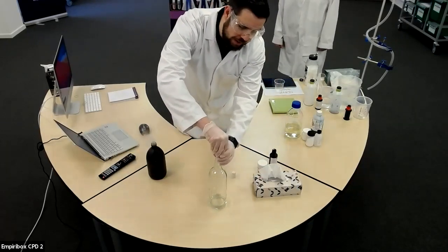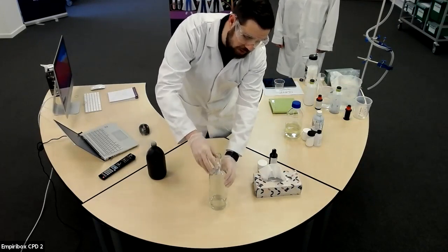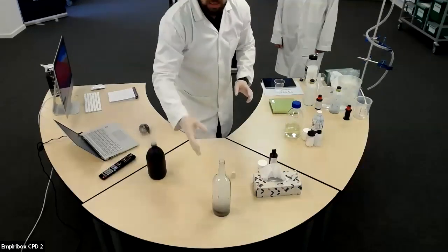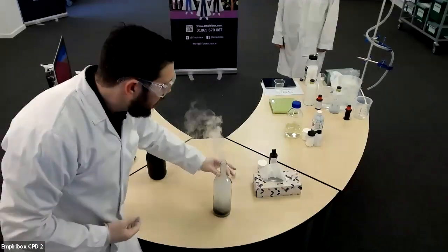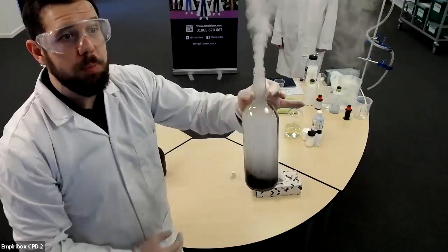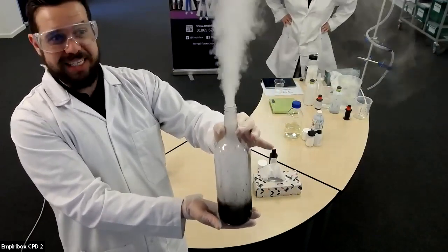Boys and girls, I'm just going to quickly pop that in there, and you're going to see what happens when I make them react with each other. If I just shake that in, you can clearly see, and there we go. This is a much clearer one. It just starts to produce a lot of smoke, and it goes almost everywhere. But there are a few other things that you might have noticed. Not just the smoke billowing out all the way, as you can see quite nicely, like a genie in a bottle. That's a much nicer one, isn't it?